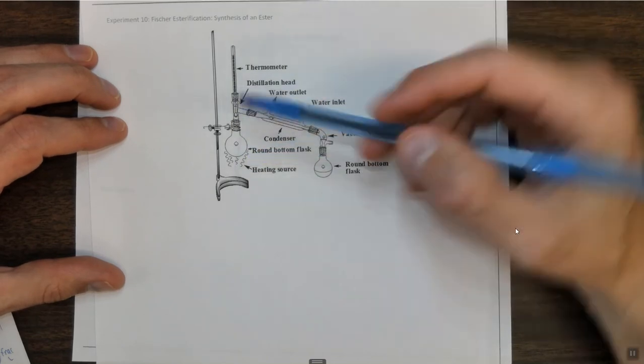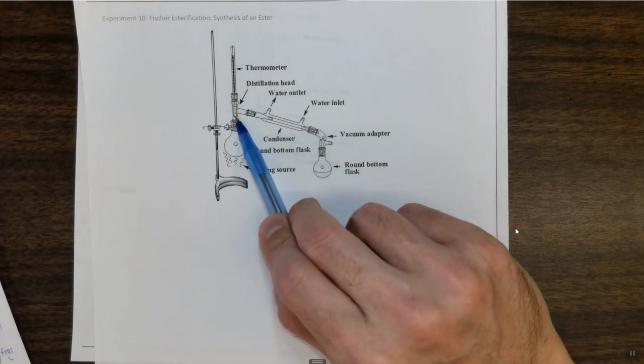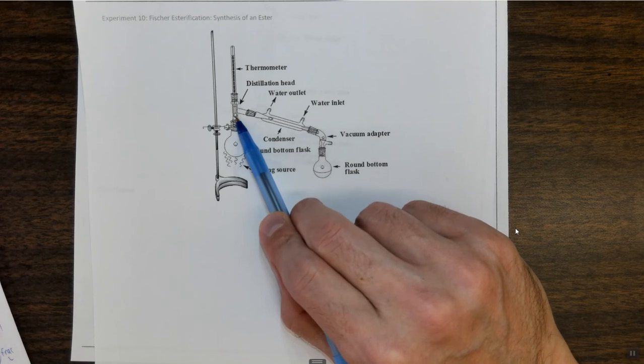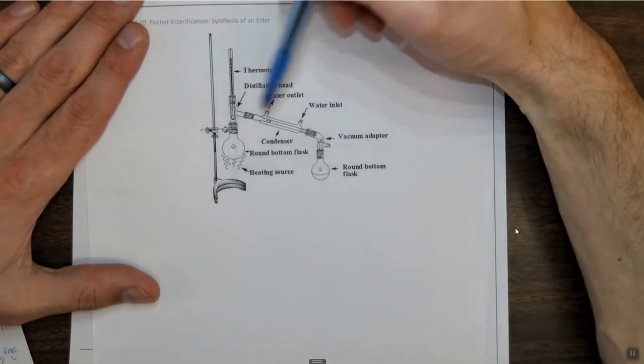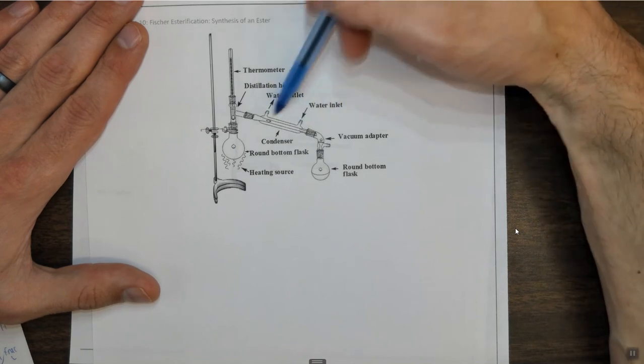You have a distillation head. Notice the place of the thermometer, and also notice that you're going to actually want to measure the boiling points. The boiling point of ether is around 35 degrees C, and the boiling point of isopropyl acetate is somewhere around 87 degrees Celsius. Then, after the distillation head, you're going to have a condenser, water in, water out.